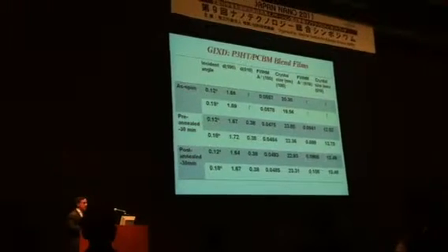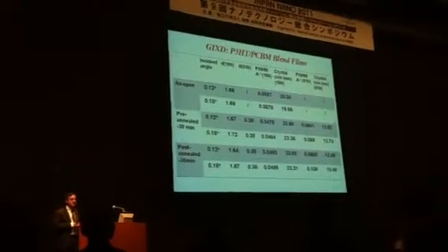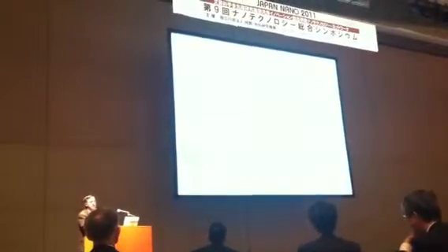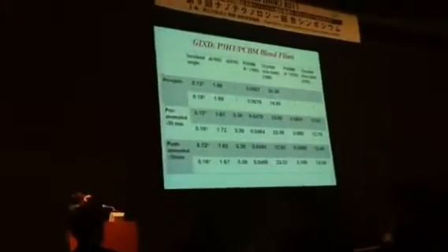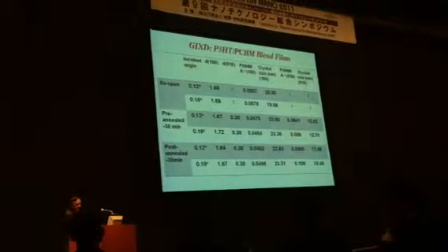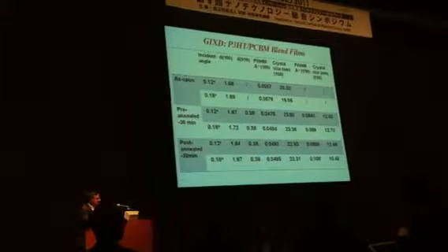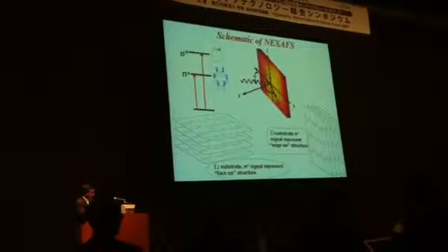And in fact, from the grazing incidence X-ray scattering measurements, you can also, from the width of the reflection, say something about the crystal size using the Scherrer equation. And if you do this, what you find is that the size scale of the structures normal to the surface are on the order of about 20 nanometers, which again is consistent with the results we have had in the past.